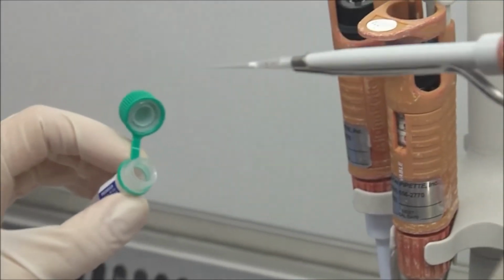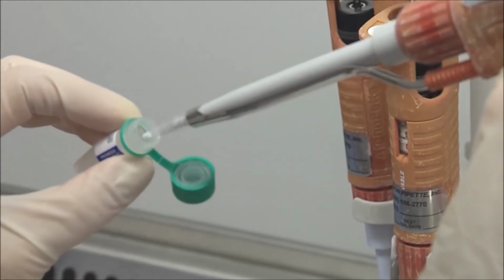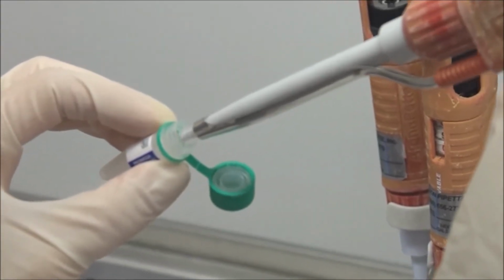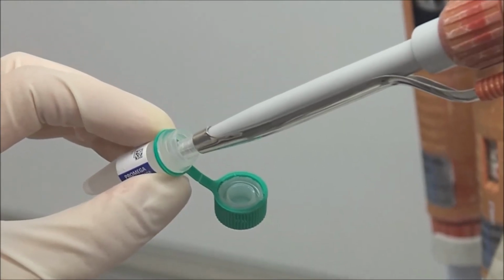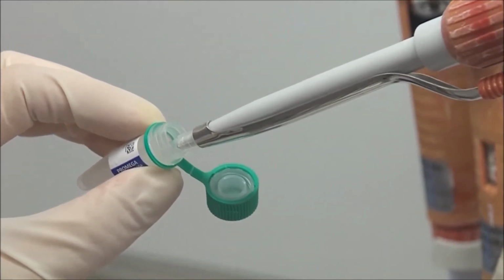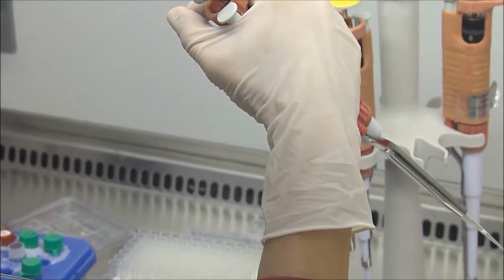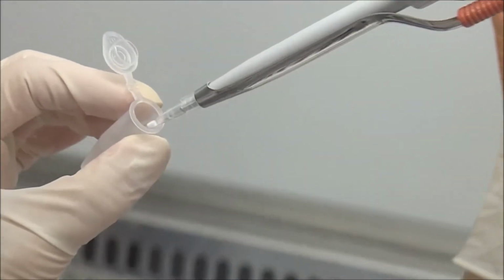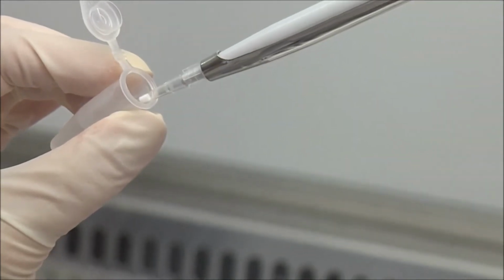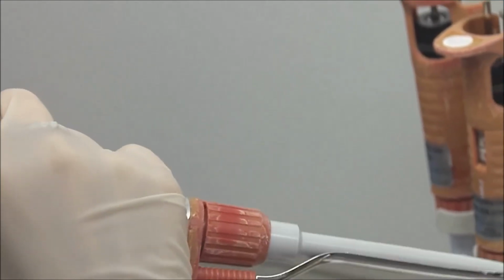The Taq polymerase is in glycerol, which is more dense than water. So when you pipette the Taq polymerase, you have to be very gentle and make sure that you get the right volume. Bởi vì Taq polymerase thường sẽ được lưu trữ ở trong glycerol thay vì bằng nước, nên khi mà hút thì nó rất là dính. Tốc độ chạy nó cũng khá là chậm, nên khi các bạn hút Taq polymerase chúng ta phải cẩn thận để làm sao cho dung dịch được hút lên hết và được đẩy ra hết.